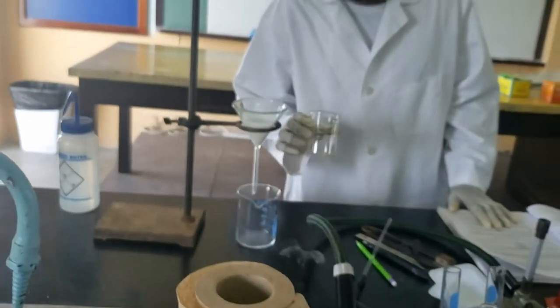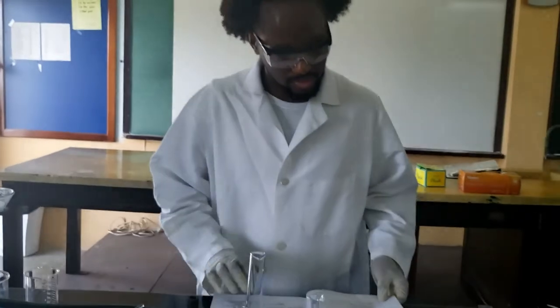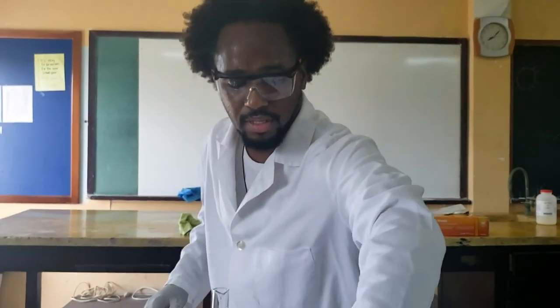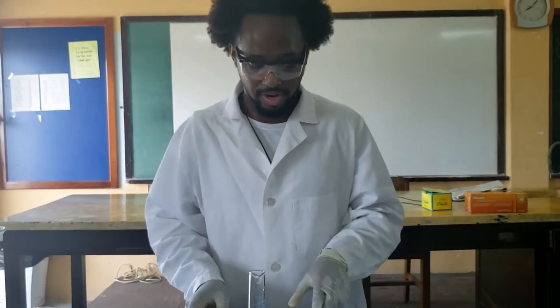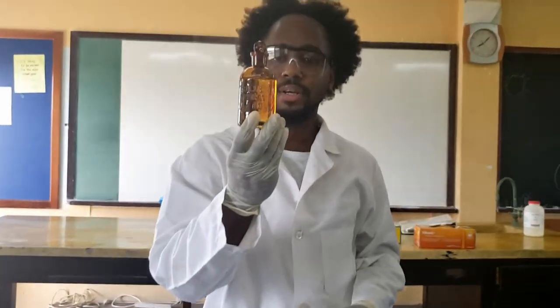While we are waiting for this to filter, let's move on to the next experiment and we will come back to that one. This experiment is a reaction with silver nitrate. We have two pieces of white paper — these are some recycled pieces of paper — and we have silver nitrate here.